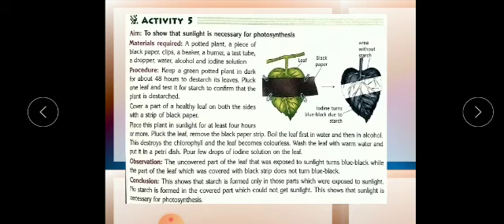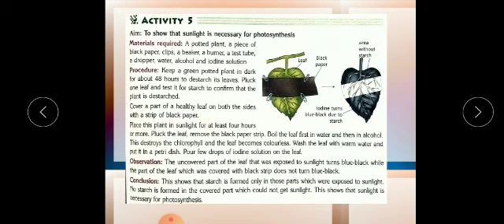Observation: the uncovered part of the leaf that was exposed to sunlight turned blue-black, while the part covered with the black chart paper — the middle part — remained unchanged, not blue-black. Conclusion: the upper and lower parts contain starch, whereas the middle portion does not. This shows that sunlight is important for photosynthesis.